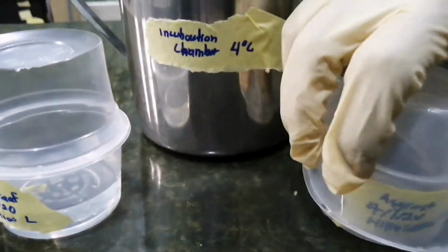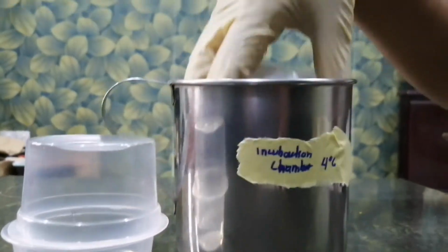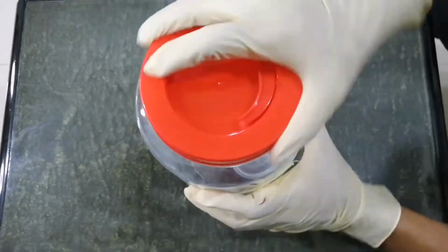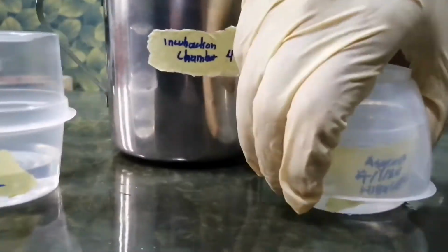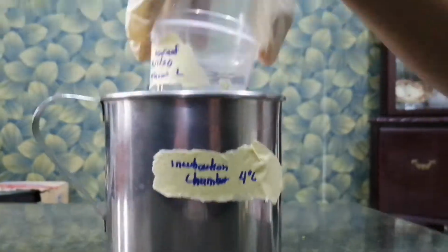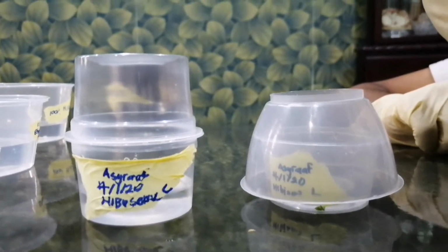Next, the specimen bottles will be incubated in the incubation chamber for 1 hour at 4 degrees Celsius. After 1 hour of incubation, the specimen bottles are taken out of the incubation chamber. The vacuum and incubation steps are repeated 3 times. Finally, keep the samples for 2 days at the incubation chamber at 4 degrees Celsius.